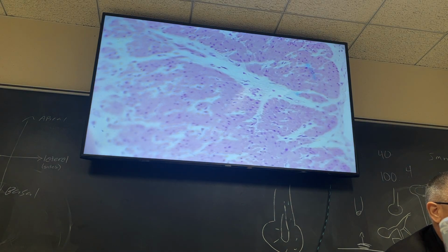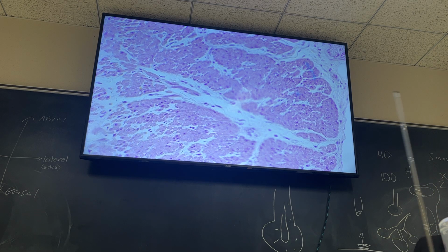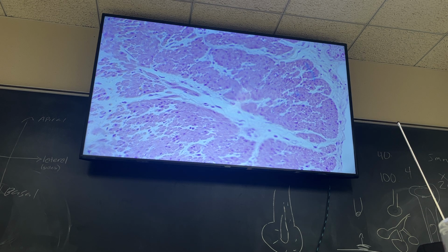And then the cross-cut one, if we slide over, look at that one, they are in little bundles per se, but they're not really highly organized. I mean, they look pretty nice, and again, the nuclei are in the middle, as you can see, and you can see the different layers of the different, not peritonia, mycia. What are the 3 mycia?